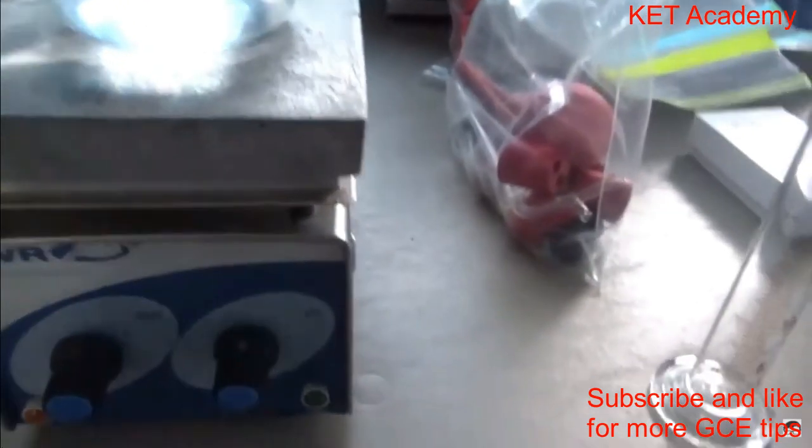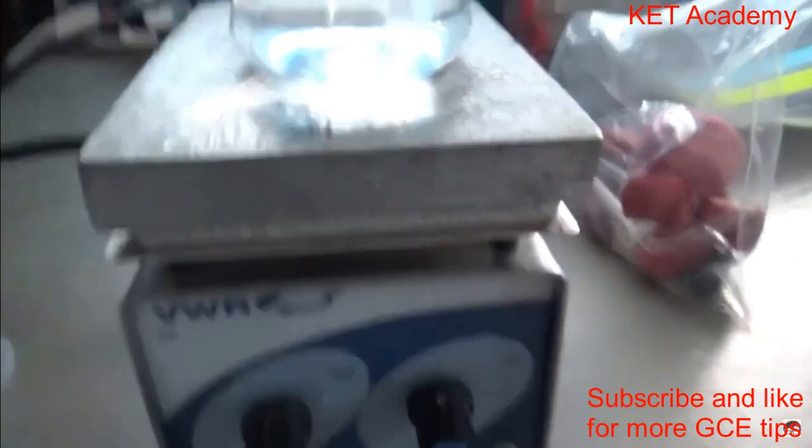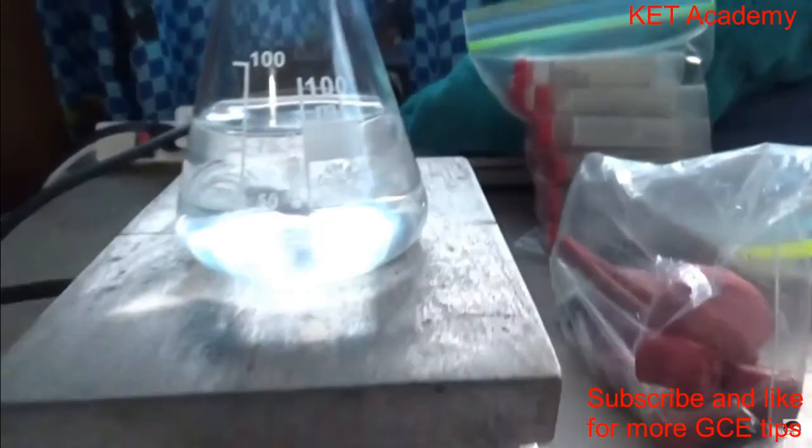Okay, I'll pick you back up, and we'll put this on there. I'm going to use my automatic stir to stir this for me. This isn't necessary, but it's just handy, and what the heck, why not use it? Okay, that goes in. It'll automatically be stirring it for me.